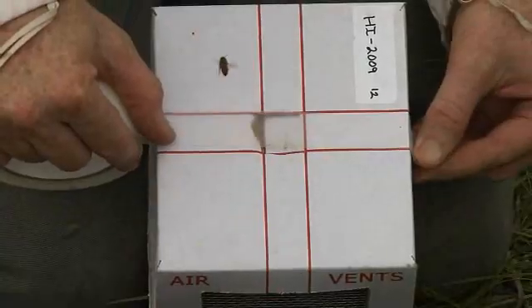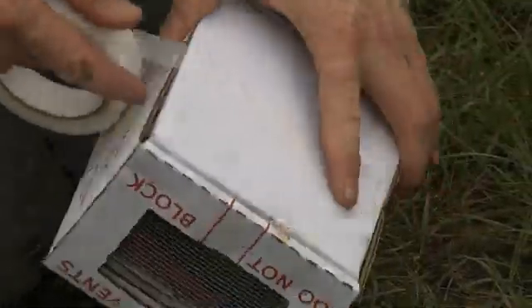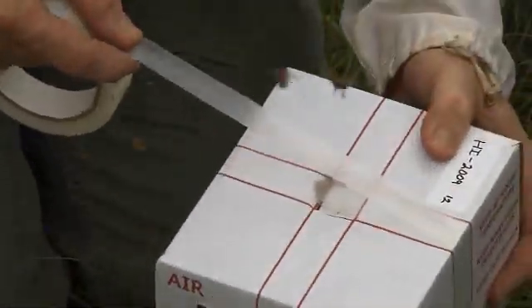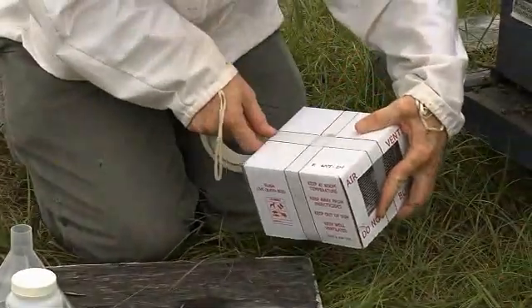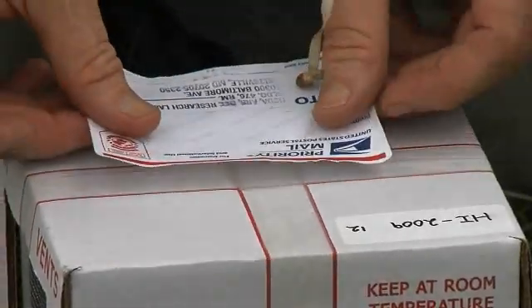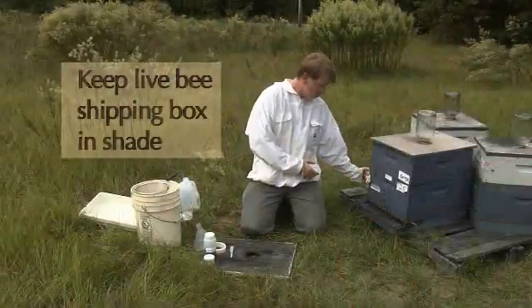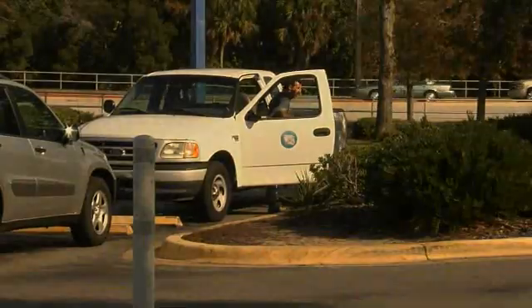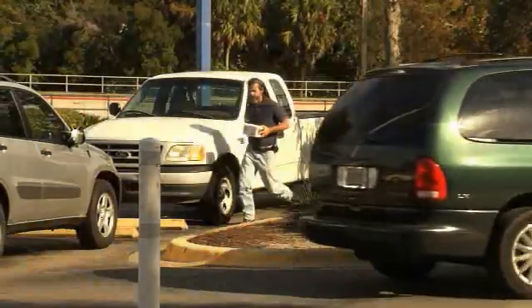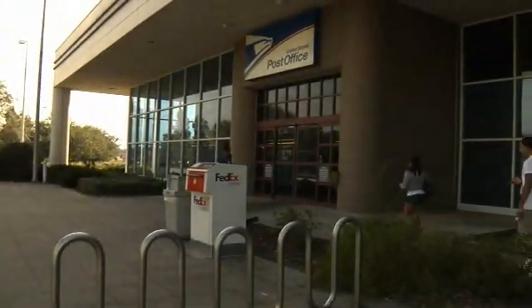Use clear binding tape — a postal service requirement — to secure the lid of the live bee shipping box. Follow the tape guidelines on the box and run the tape around the box twice in both directions. Place the mailing label on the top of the live bee shipping box and affix the provided postage. To protect the bees, be sure to keep the live shipping box in the shade and out of direct sunlight. Take the live bee shipping box to the nearest post office during business hours on the same day of collection — the post office must be open to receive this type of package.